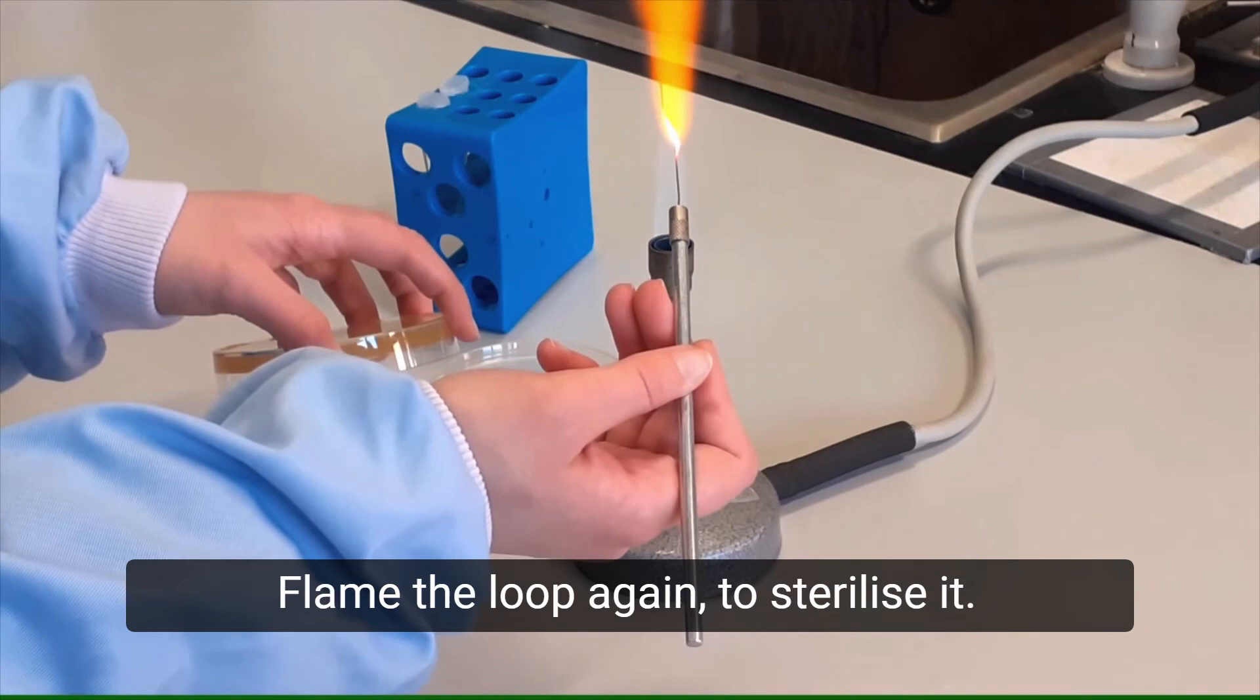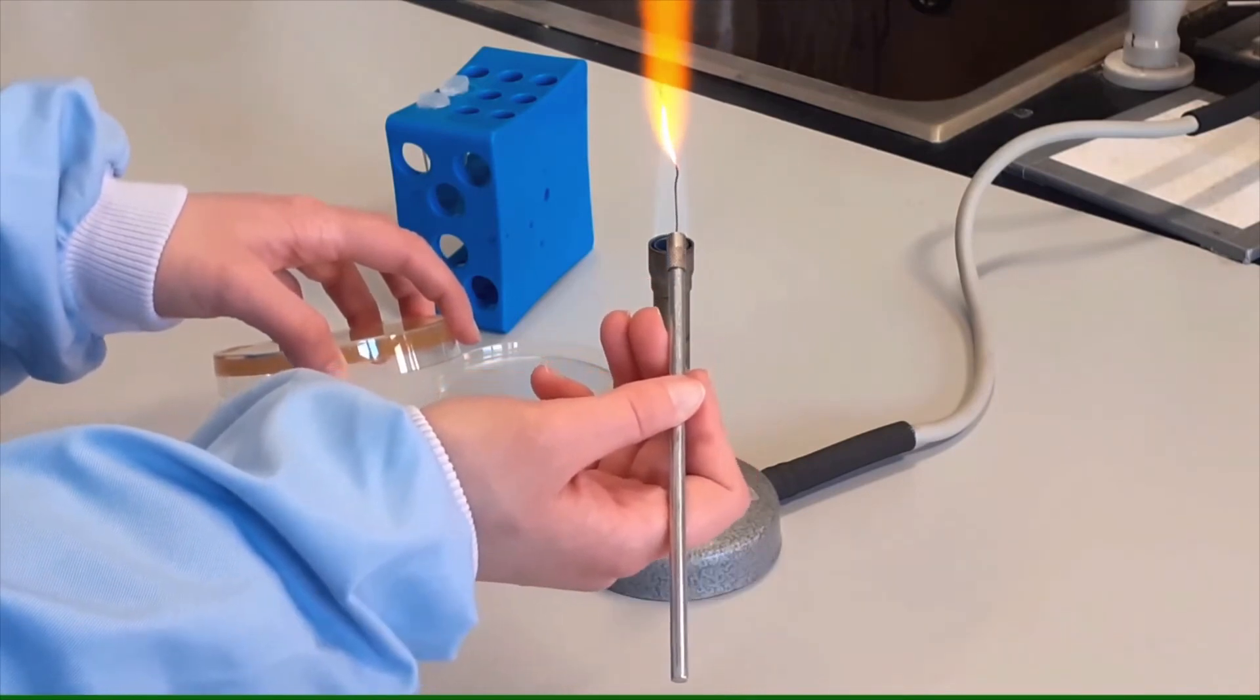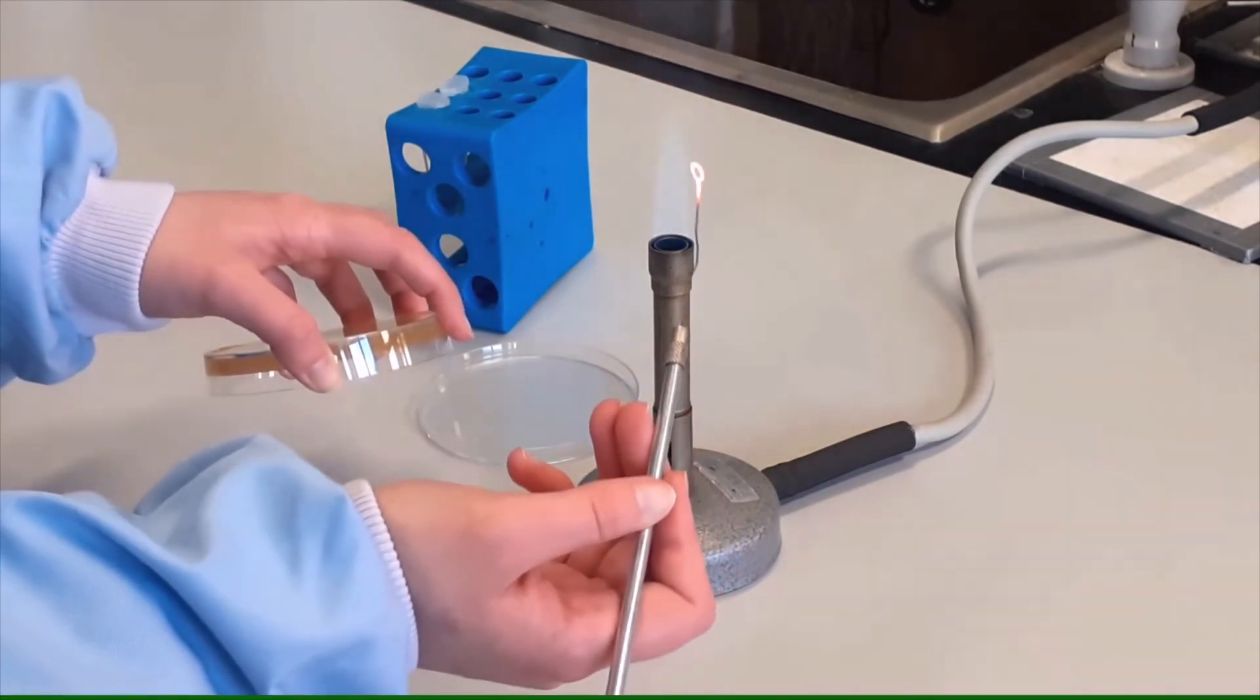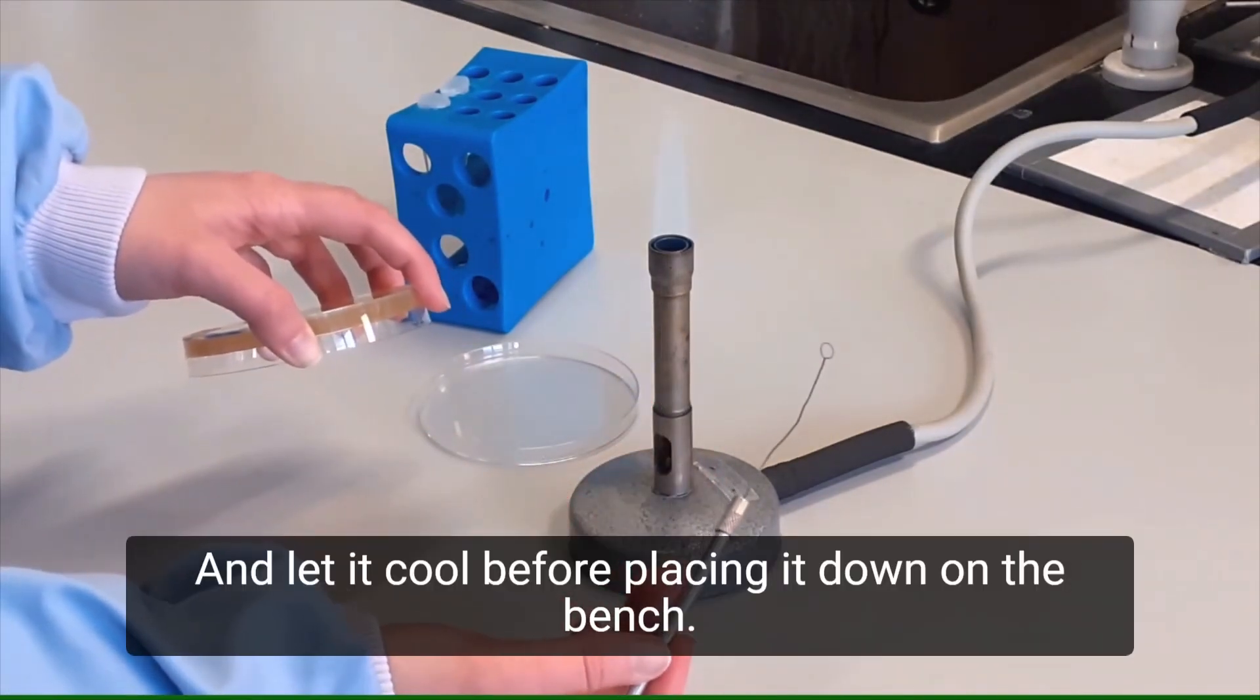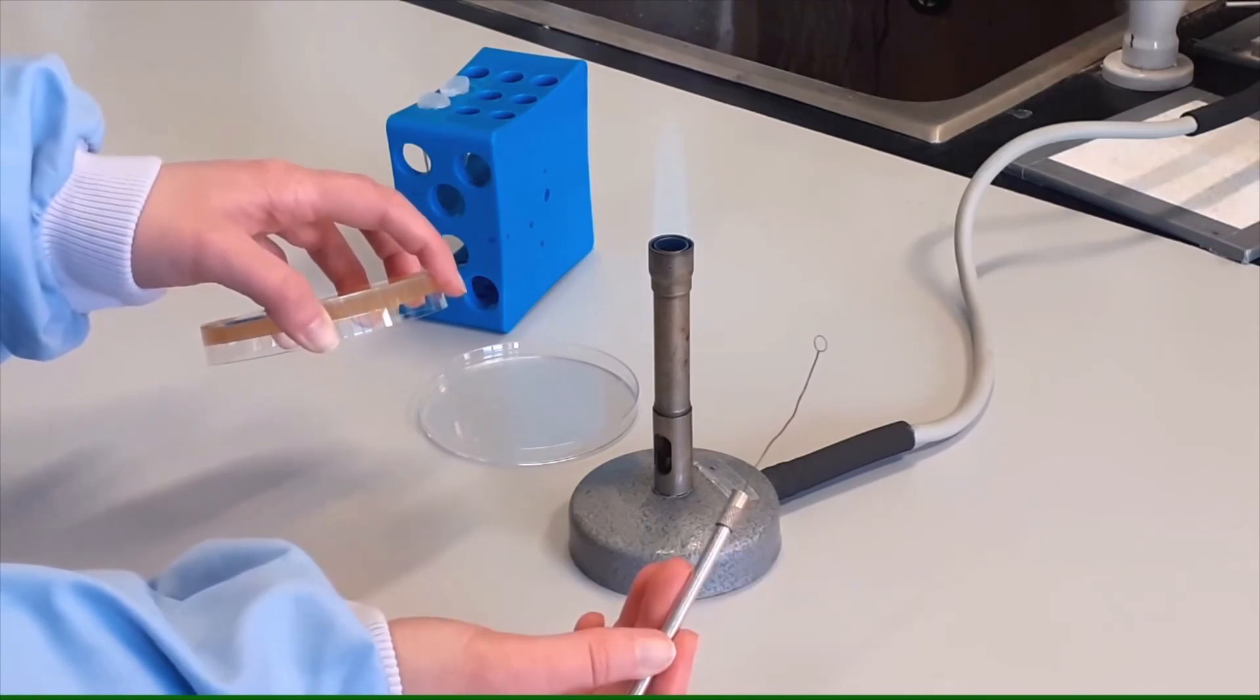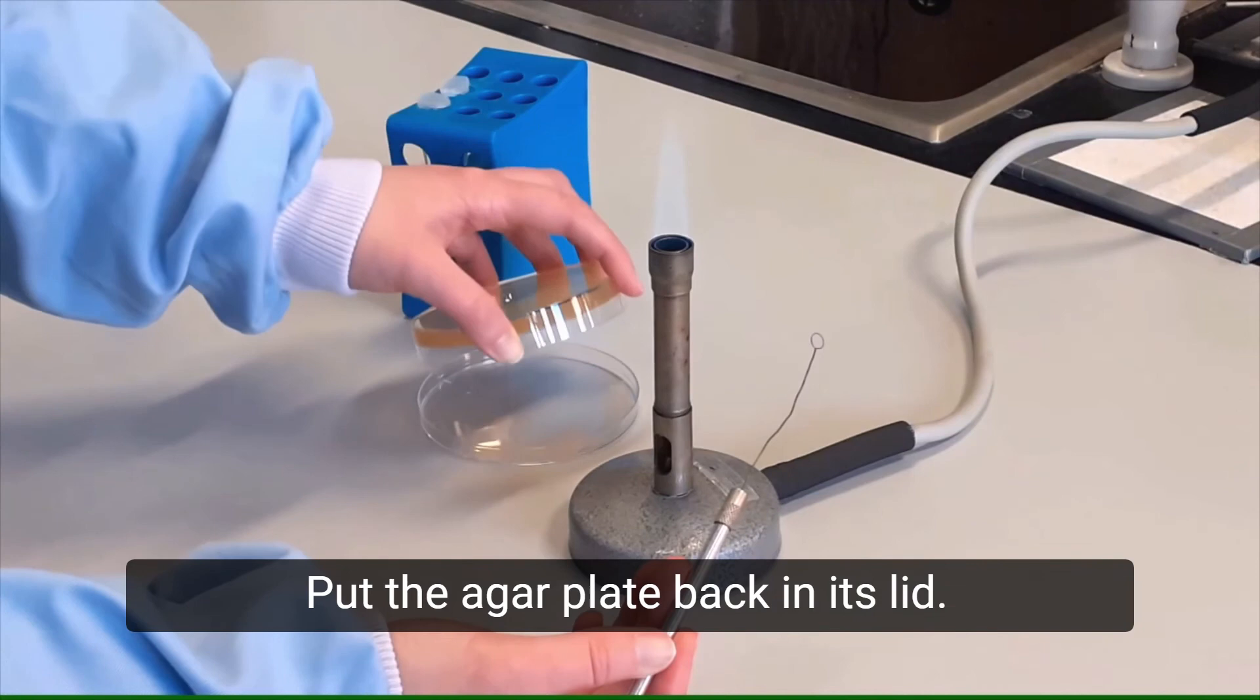Flame the loop again to sterilize it and let it cool before placing it down on the bench. Put the agar plate back in its lid.